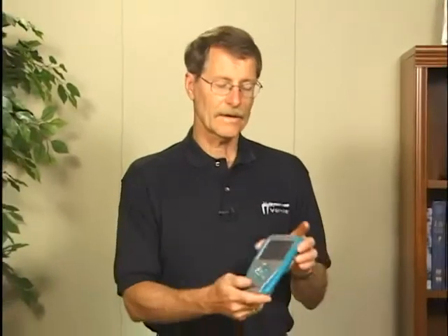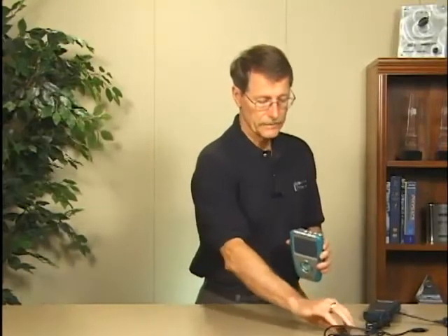We have several interfaces you can choose from. This is our LabQuest — a rugged, water-resistant handheld device with a color touchscreen. It has rechargeable batteries that should last all day, and it has six ports for sensors.